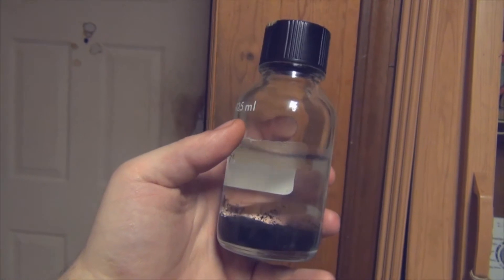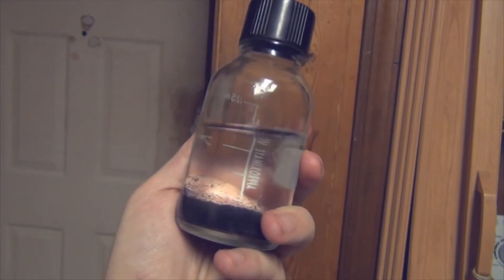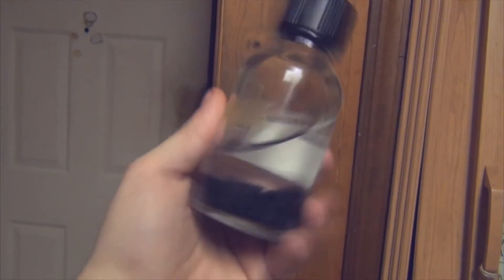Today in this video we're going to be making some graphene. In a future video we'll be using this to make supercapacitors.